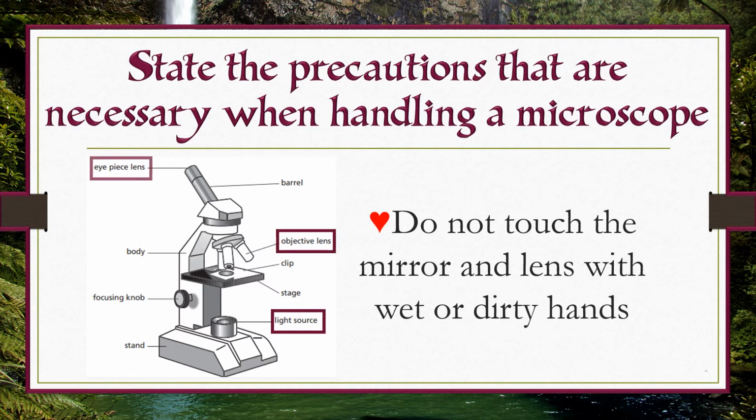Do not touch the mirror and the lens with wet or dirty hands.